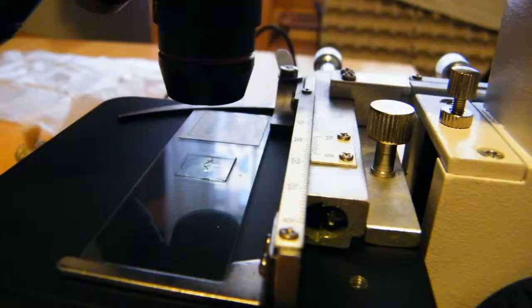Even small living creatures move, so I might have to follow them even when using a huge magnification, or I might have to look for a certain part of an object under the microscope. My researchers have revealed I will need a really good and smoothly working mechanical microscope stage. And the whole microscope should not be too lightweight. And at least my wallet tells me not to spend more than $300.